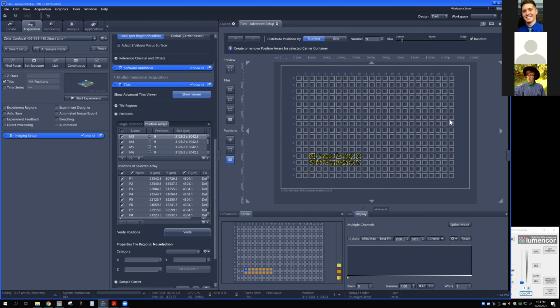The 10x has a lot more angle to it. The 20x is also very shallow, so that one comes up pretty close, and you might not be able to get too close to the edge of your plate without having it strike the edge or the skirt of the multi-well plate. One thing that you can do though is that multi-well plates come in different skirt heights.